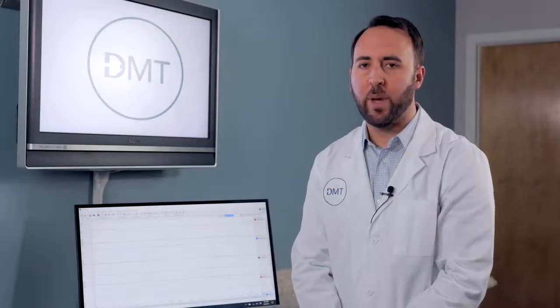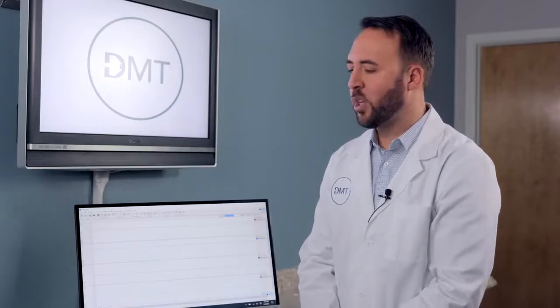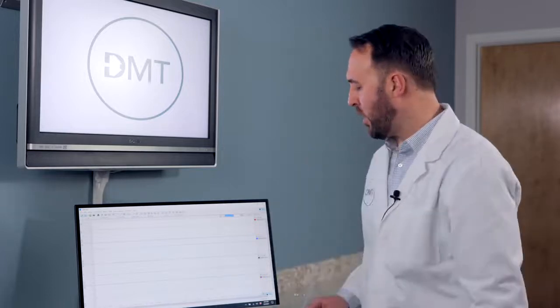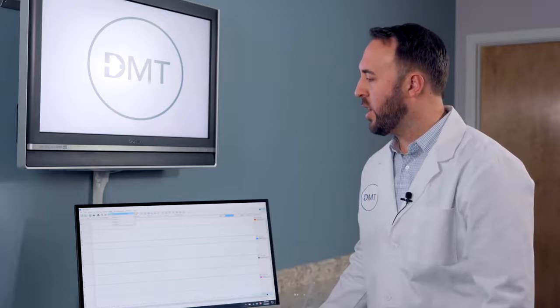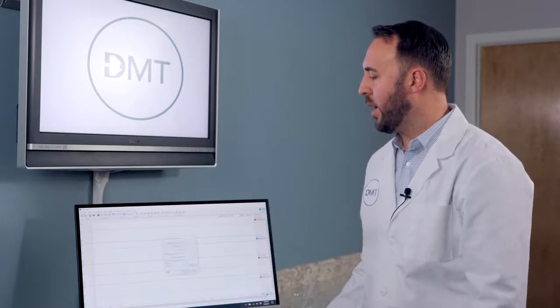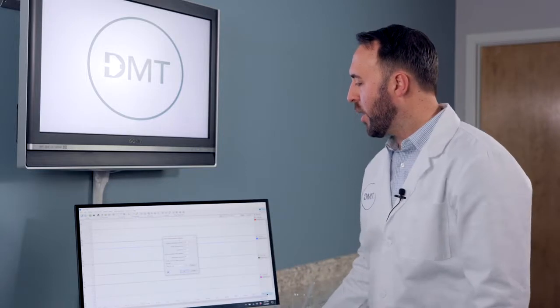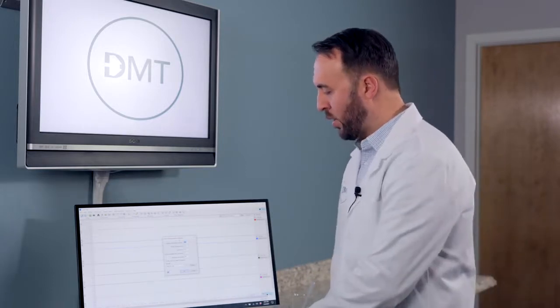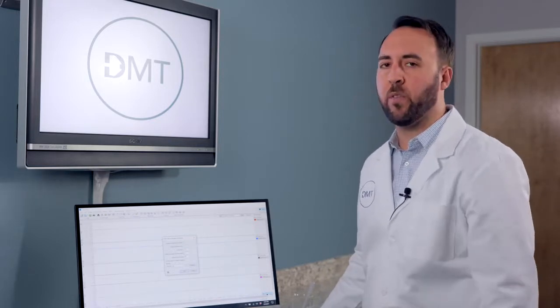After these 20 minutes have passed and your chambers have reached the experimental temperatures, you can now start the normalization. Again, today we're going to use the DMT normalization module on LabChart. So we click on the DMT and settings. Now these settings will be dependent on the type of vessel you are using. The first is eyepiece calibration, and we're going to use 1 so that we can type in the length of our vessel.